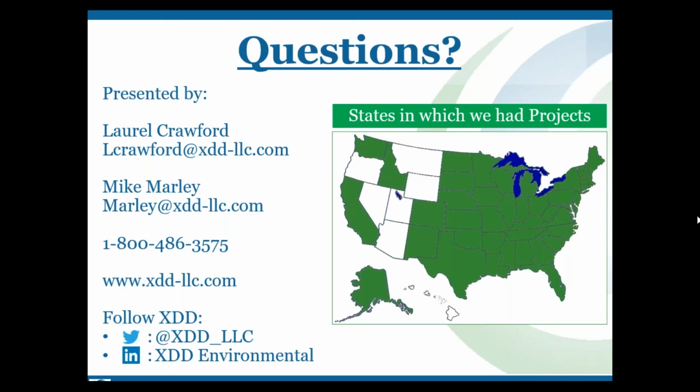So we had a lot more demand for the oxidant than represented by the soil that was provided initially. One of the giveaways was they said from the field that they were getting a yellowish tone to the water, which is typical of what you would see with high organic matter and a chemical oxidant. That relayed what the problem was. We helped them fix that, and the problem was treated.